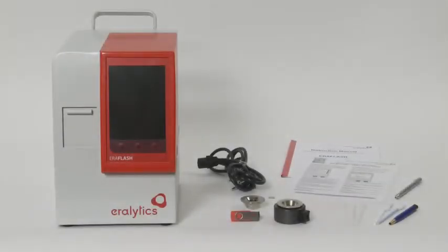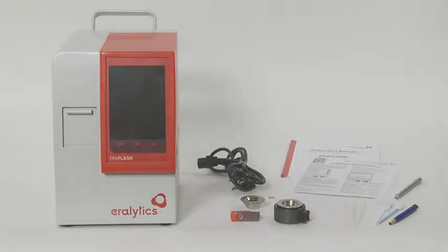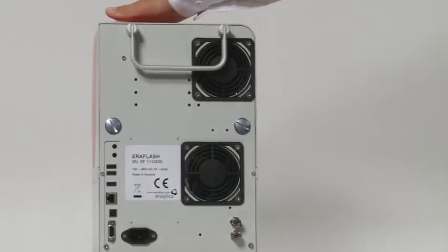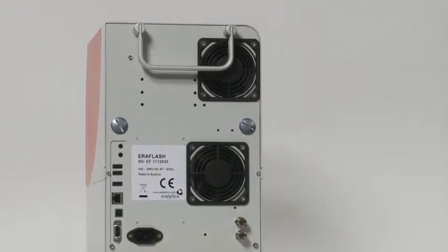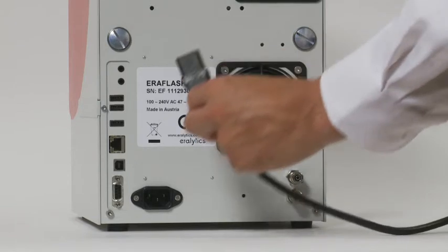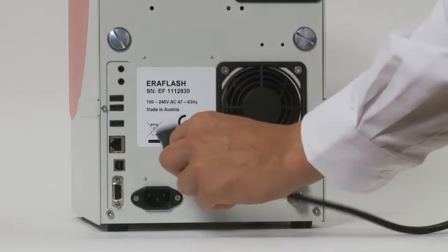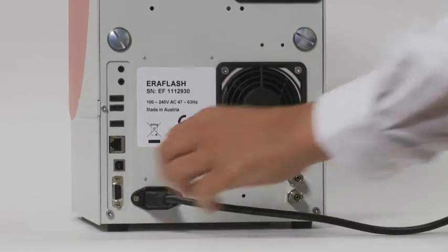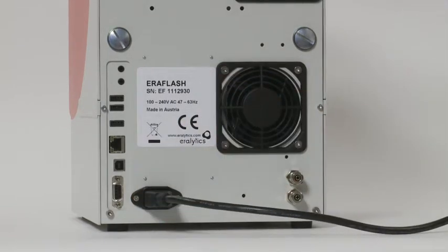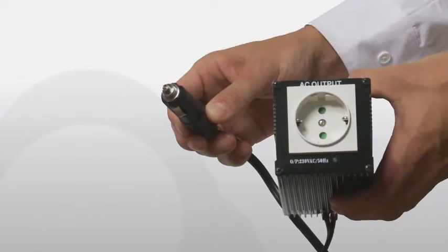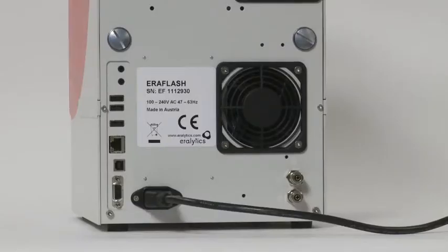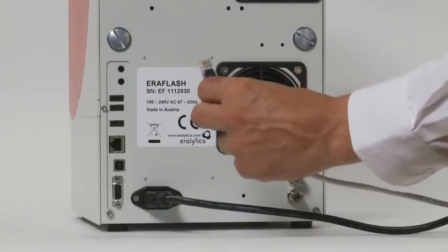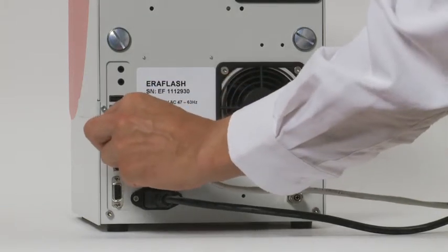Please verify that the delivery is complete and carefully read the instruction manual. Turn the instrument over and connect the power cable to the plug on the rear side. The AC input voltage can be anywhere between 85 and 264 volts. If the instrument is used in mobile laboratories or in the field, it can also be operated at 12 volts DC using a DC/AC converter.